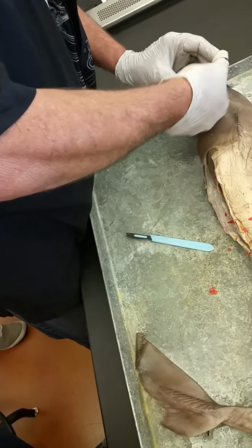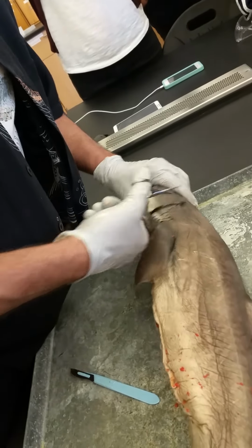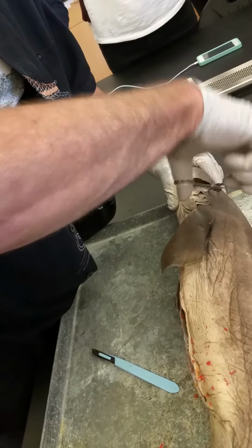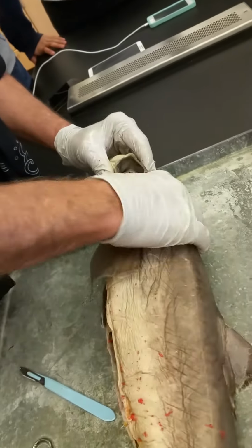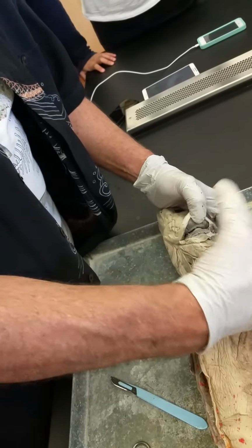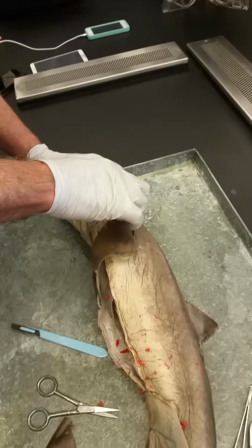Let's go look. Remember, it's a different color because it's preserved.